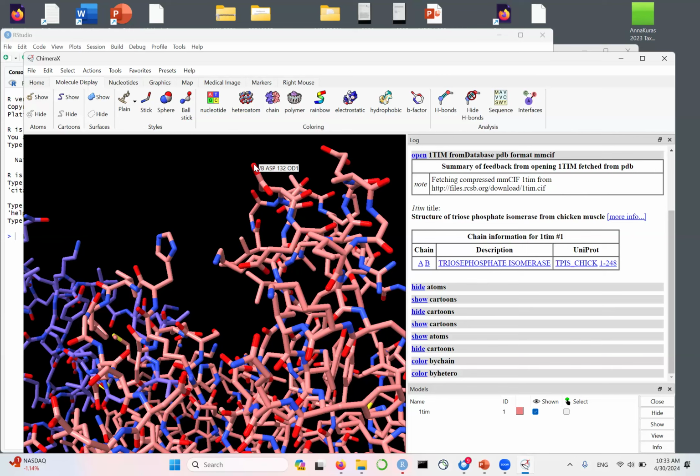The first letter always denotes the element. So O is going to be oxygen, and then you're going to have OA, OB, OC. Those are going to be different oxygens within the same residue, and this is consistent. Every residue has its own pattern of atom names, so it's reproducible, and you can tell which atom it is within the residue. So that's how you can find out what the given atom is.